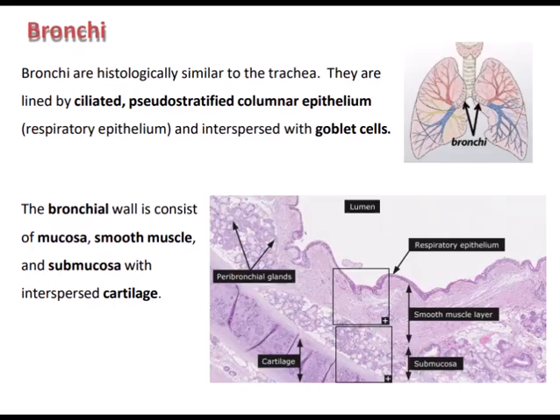Layer of bronchial walls from lumen to outward. It's also mucosa epithelium. It's made up of pseudostratified ciliated columnar epithelium with goblet cell. Same as trachea, but height of epithelium gradually decreases as bronchi get smaller. Goblet cells reduce distally.